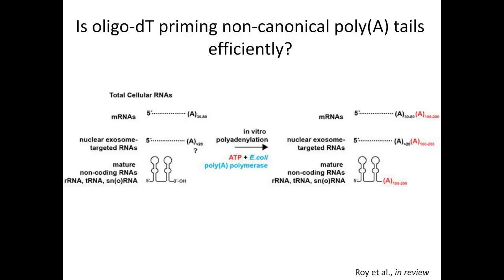In this case, we used the Epicenter kit, which has oligonucleotides that bind to ribosomal RNA to remove them from the sample. And that actually worked out quite well. After that, we reduced the ribosomal RNA reads to less than 5%.